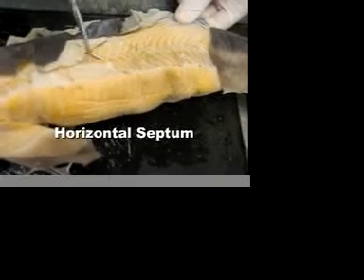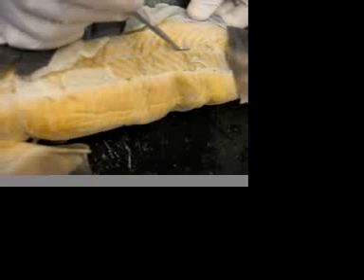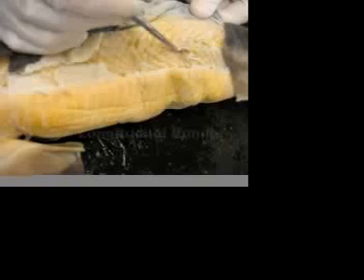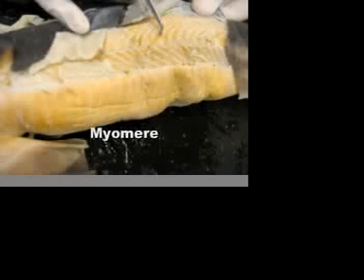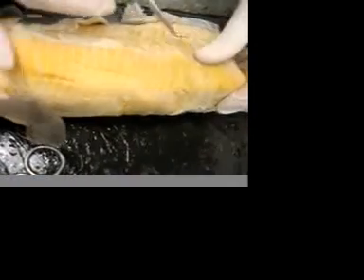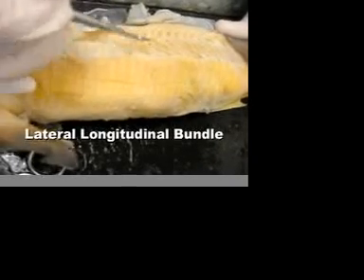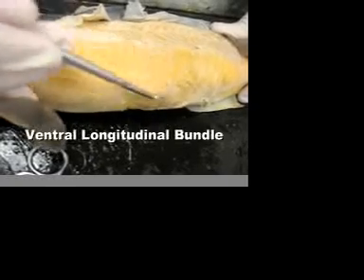First we have the horizontal septum going across. Directly above that, dorsally, is the dorsal longitudinal bundle. You can see each segment is a myomere and in between are myoscepta — we have the whole membrane as well. Ventrally of the horizontal septum is the lateral longitudinal bundle, and ventral to that is the ventral longitudinal bundle.